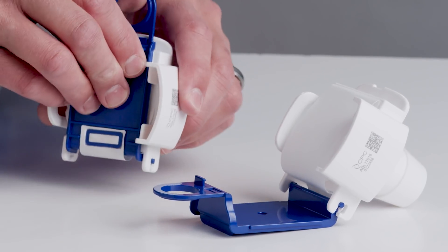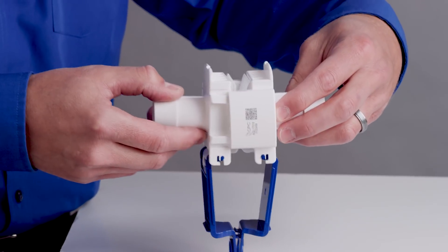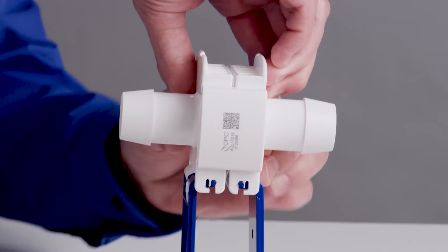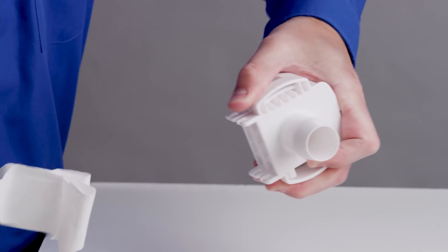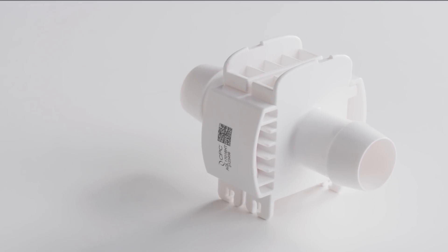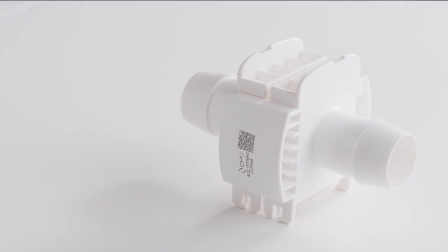Like all AseptiQuick connectors, our new one-inch size offers you these advantages. Our three-step connection process allows you to make quick and easy connections, even in non-sterile environments. It also offers a laser etched data code — the simple way to access key product resources and validation information.